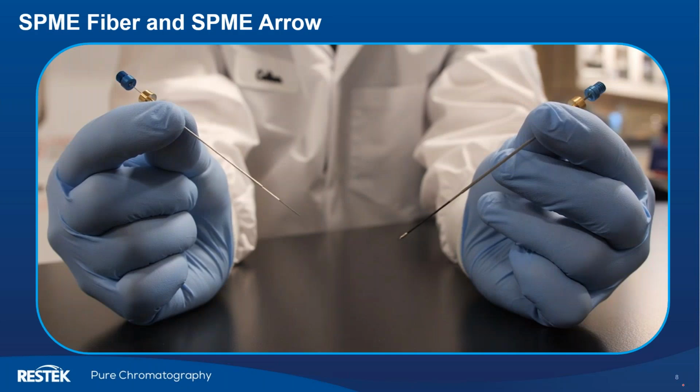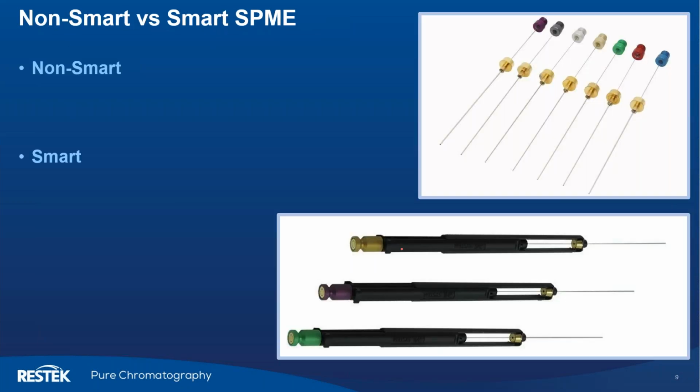So then looking at the SPME fiber versus the SPME arrow, I've mentioned both of these devices. You can see the greatest difference in these boxes that are highlighted, right? The black area on the fiber and the black area on the arrow, that's our carbon wide range coating. And you can see that the volume of coating is much greater, which I'll get into in a little bit. The arrow also offers some nice unique features, which I'll also get into, that provide much better mechanical robustness for your analyses.